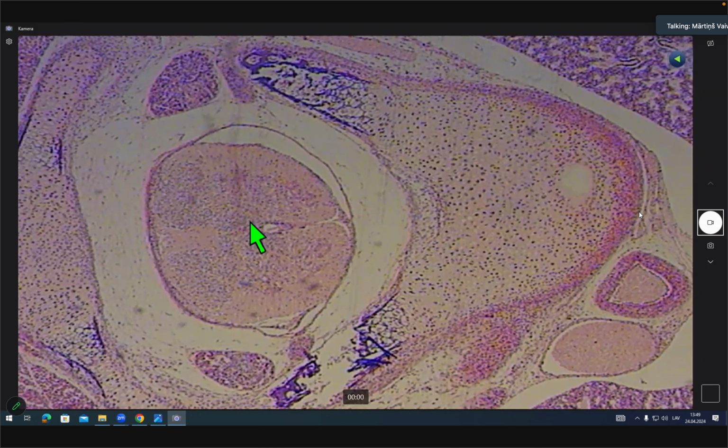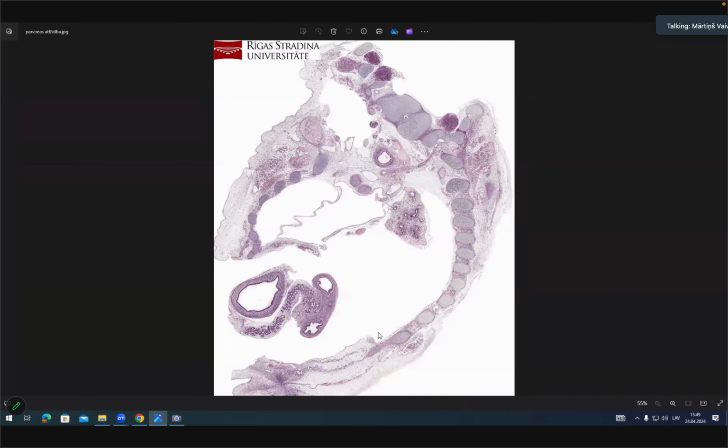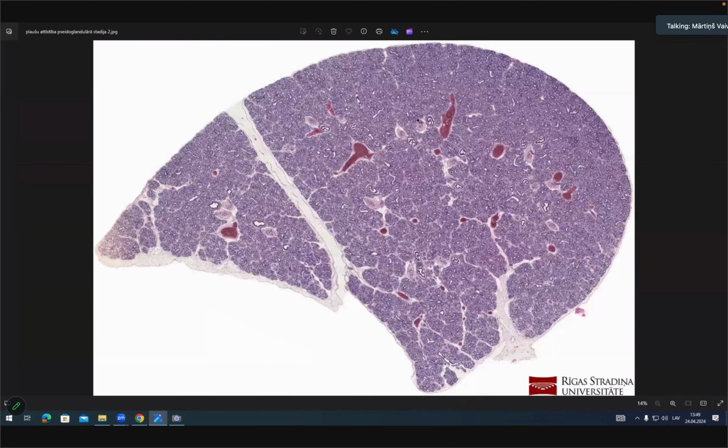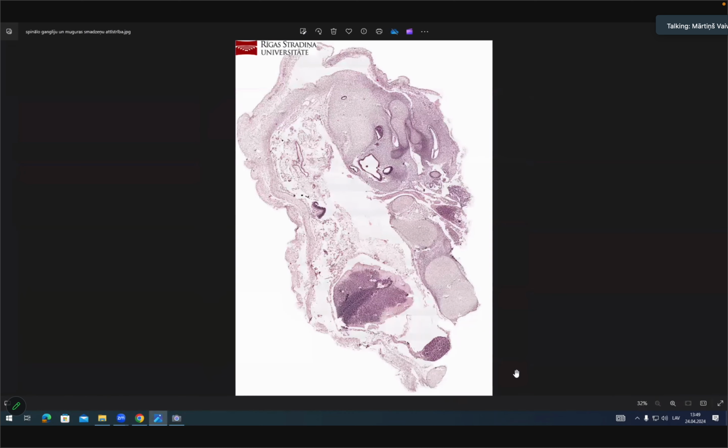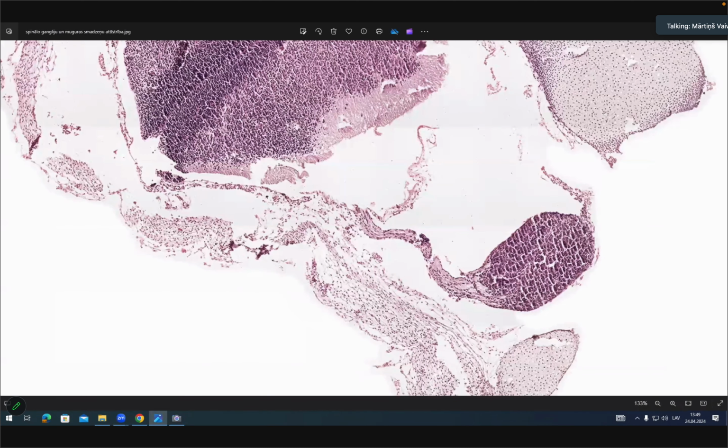We have 2 more slides to check, and both of them are a bit tricky. Let's check spinal ganglion development. So developing spinal ganglion. That would be, I will find this slide. Developing spinal ganglion, and I will zoom here at the bottom. So developing spinal ganglion.